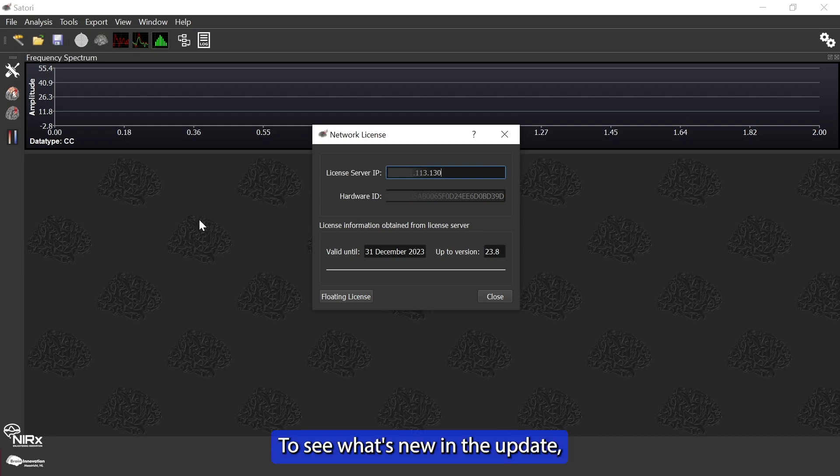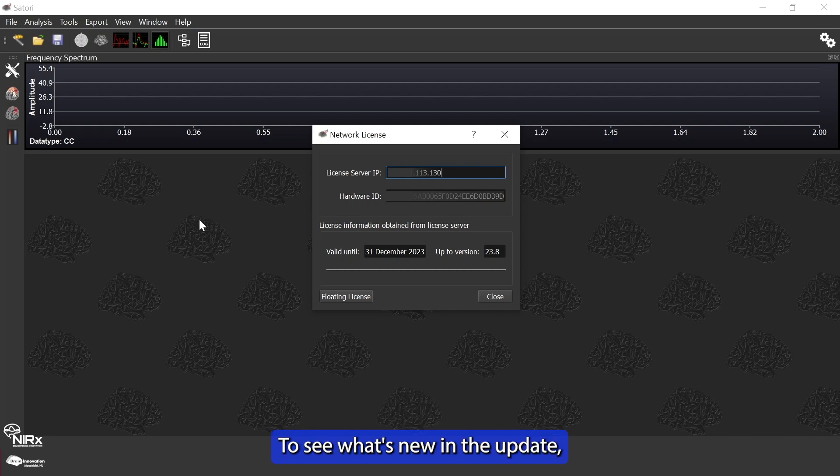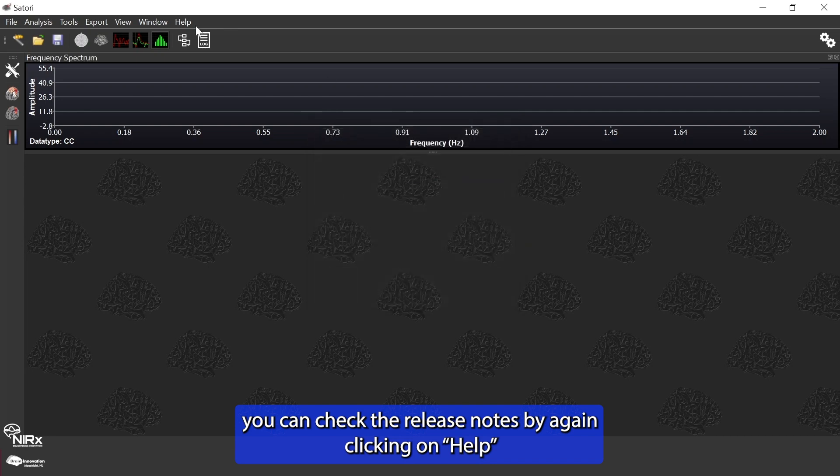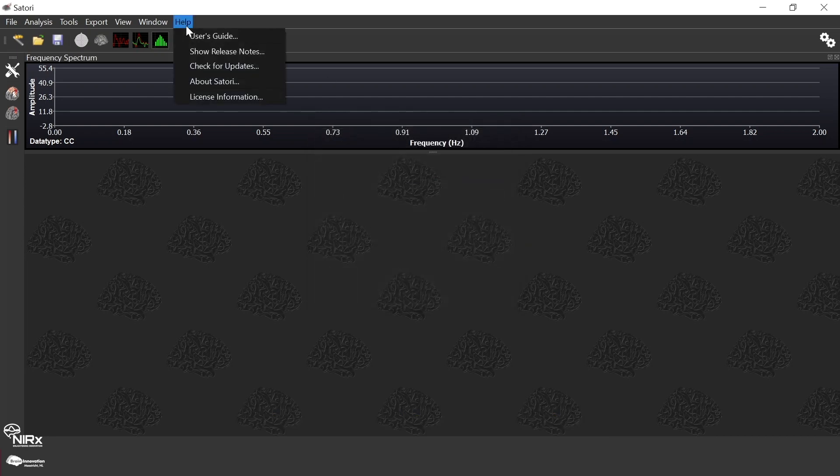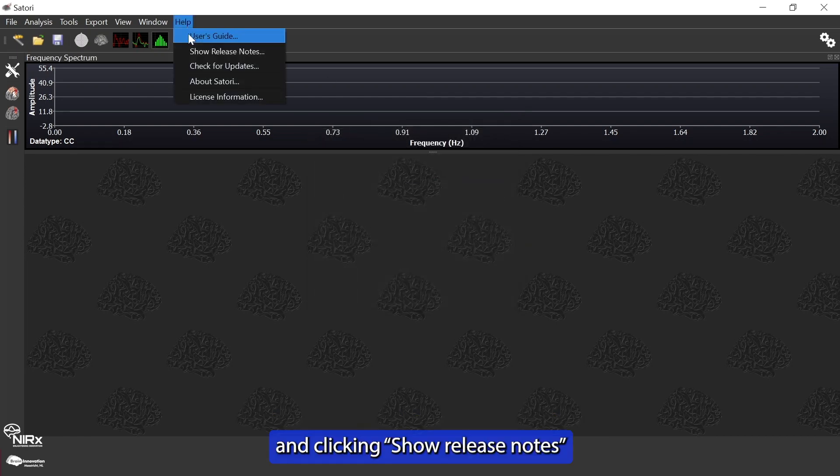To see what's new in the update, you can check the release notes by clicking on help and clicking show release notes.